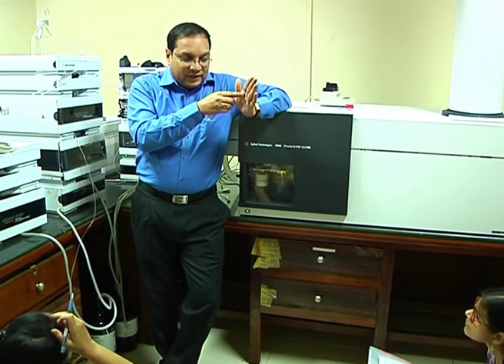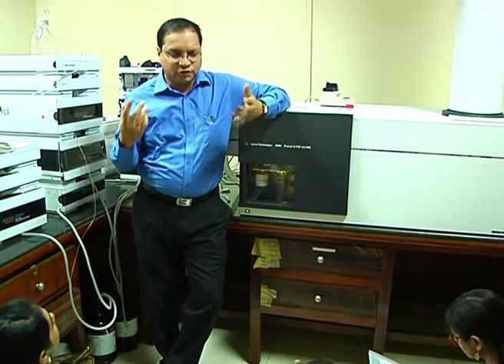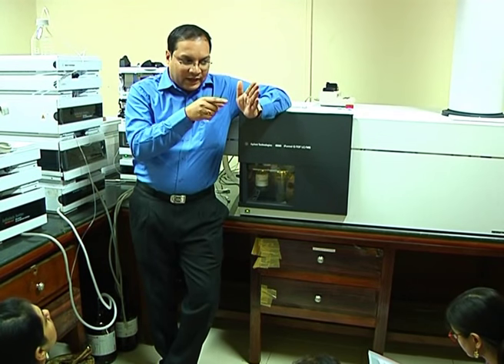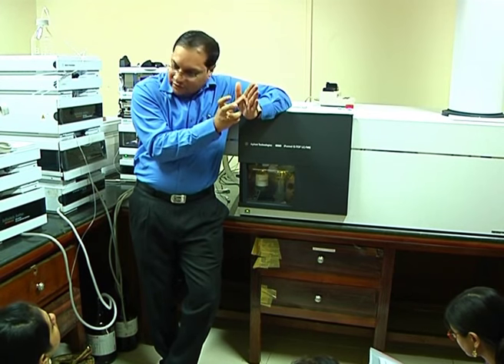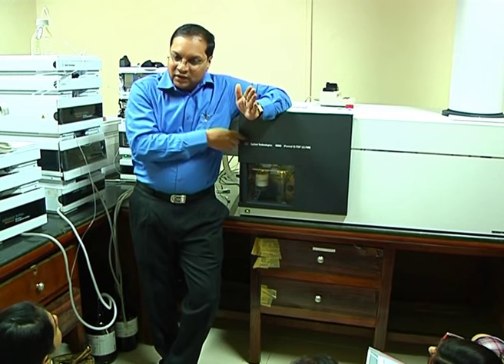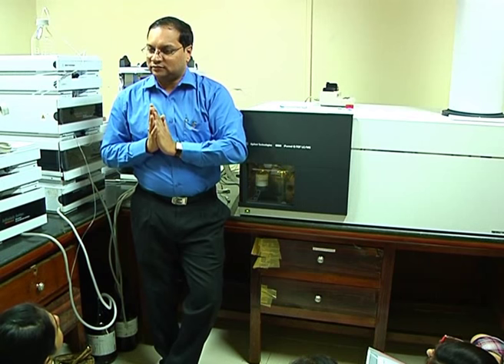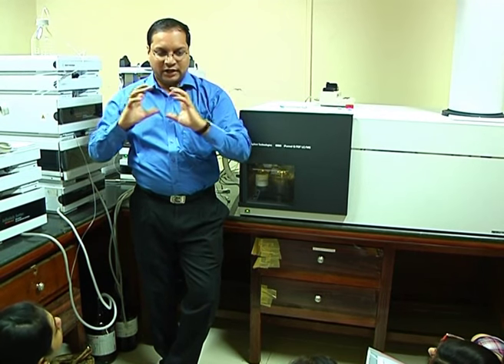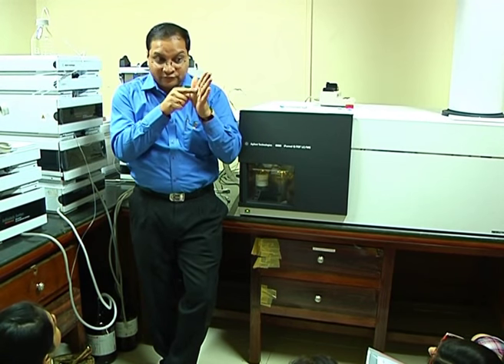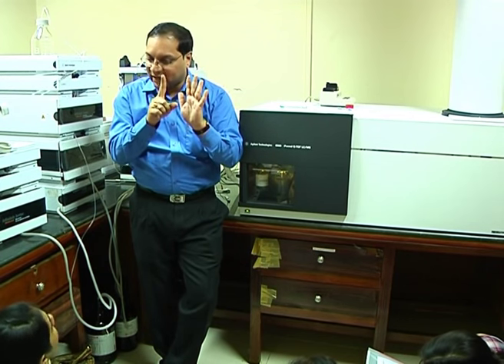And I know my peptide will not come beyond 1200. Meaning I am wasting some time scanning something which is useless. Instead of that, I can spend the same time to capture something which is informative. So I take advantage of the quadrupole there, to say look for mass from 200 to 1200 only. It will filter the others and only allow 200 to 1200, and then in 1 second I scan up to 1200 and come back. So that is the scan time.